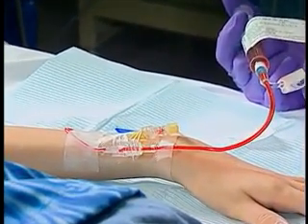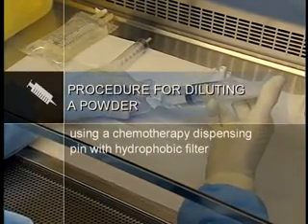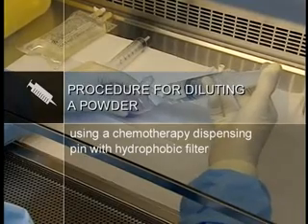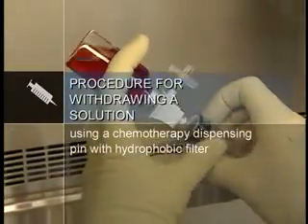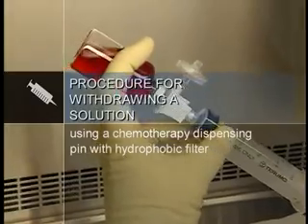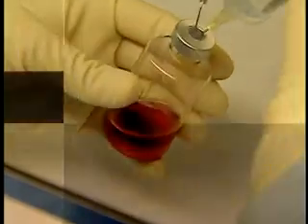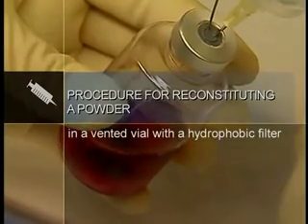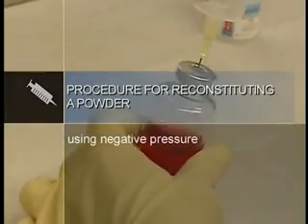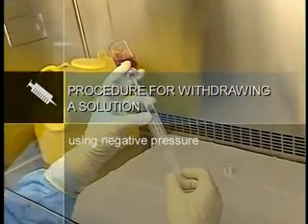This video demonstrates 6 procedures. Procedure for diluting a powder using a chemotherapy dispensing pin with hydrophobic filter. Procedure for withdrawing a solution using a chemotherapy dispensing pin with hydrophobic filter. Procedure for attaching a tubing. Procedure for reconstituting a powder in a vented vial with a hydrophobic filter. Procedure for reconstituting a powder using negative pressure. Procedure for withdrawing a solution using negative pressure.